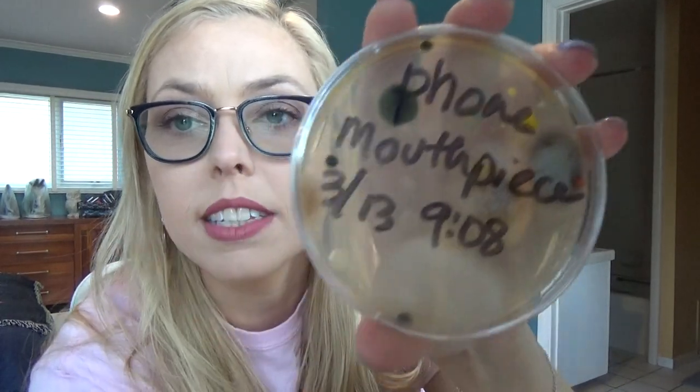Let's look at stuff in the classroom that you guys touch. We'll look at the phone mouthpiece and then the fridge handle. Here's the phone mouthpiece — you can see there are some black dots, some orange, and a yellow one up there in the corner. There's a bunch of stuff on the mouthpiece including this big bad boy up there. The phone is pretty icky — I'll make a note to clean that more often, though not that many students answer it. Still, compared to other things, not too bad. Just wait till you see the hands without sanitizer.